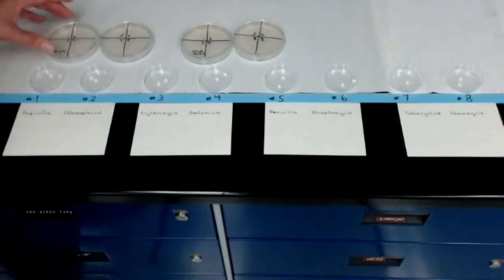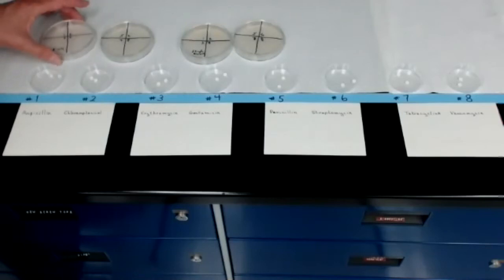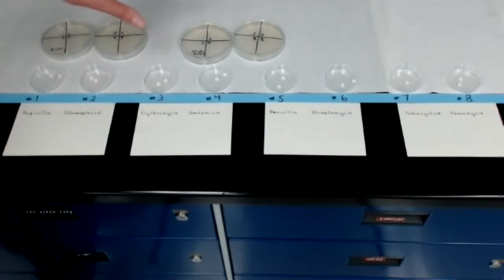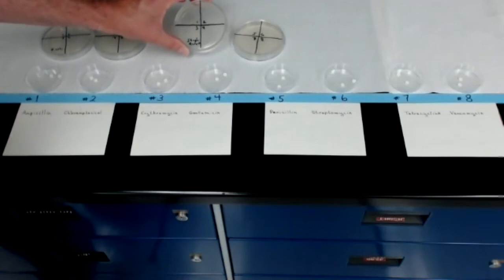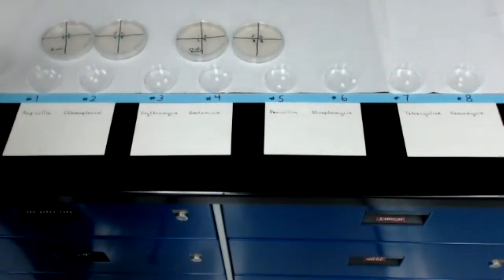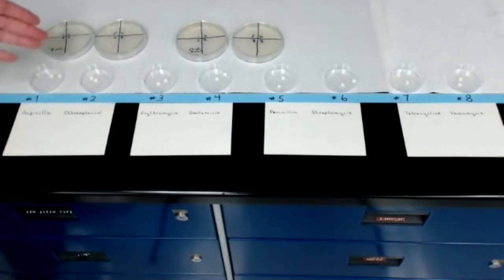I've already gone ahead and divided each of the plates into quadrants, and I've labeled the 2 E. coli plates 1, 2, 3, 4, the second plate 5, 6, 7, 8. The 2 plates of Staph aureus, I labeled the first plate 1, 2, 3, 4, second plate 5, 6, 7, 8. Obviously, the numbers assigned to each quadrant are meant to correspond to the number of the antibiotic that will be placed within that quadrant.